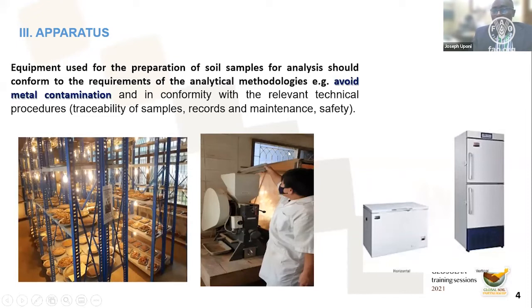All due safety procedures also must be observed. In the picture here, where I'm moving my mouse, we see an example of a drying facility with metal racks and shelves in a well-aerated place. That is a requirement, a good requirement for a good provision for soil drying, for instance. But take note, the issue of making sure that samples are not contaminated is very, very important. So give enough space between the samples.